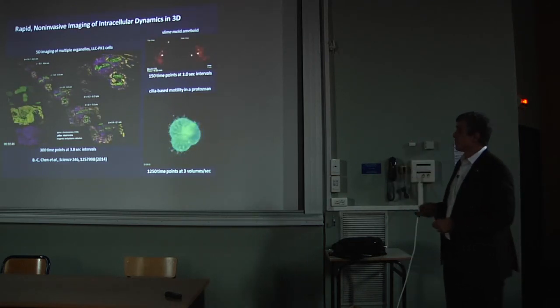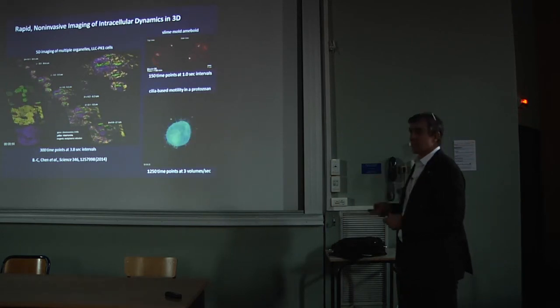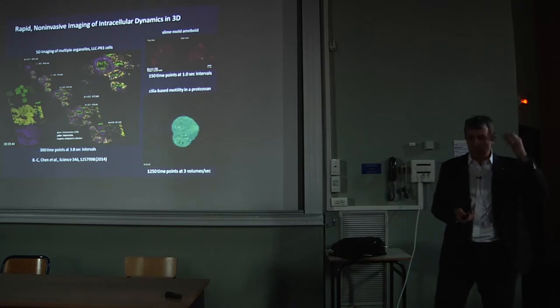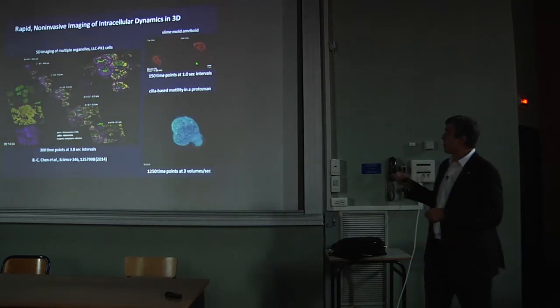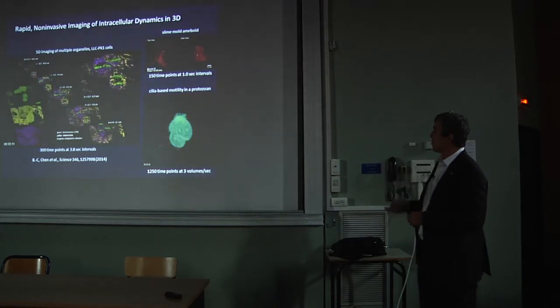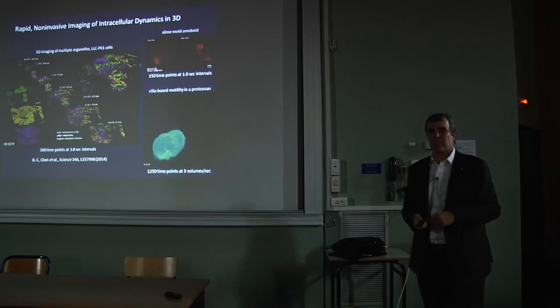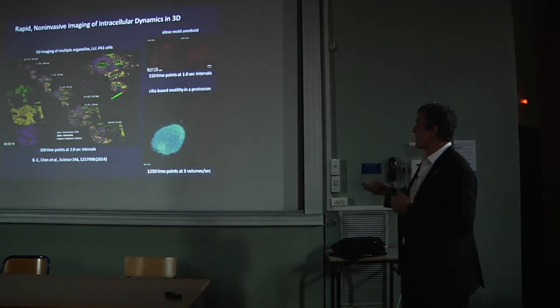Here's another example of looking at a slime mold amoeboid, which is a model organism called Dictyostelium. And these are very light sensitive. What you can see when the movie wraps around is that there's a strange little lightning bolt. When we first saw that with our collaborators, they go, what the fuck was that? You know, why are you asking us? We're not biologists, I don't know.